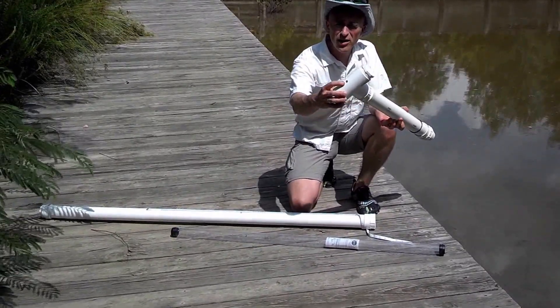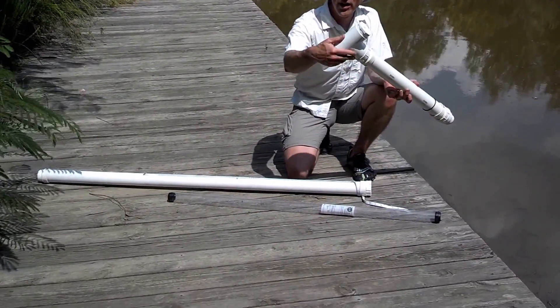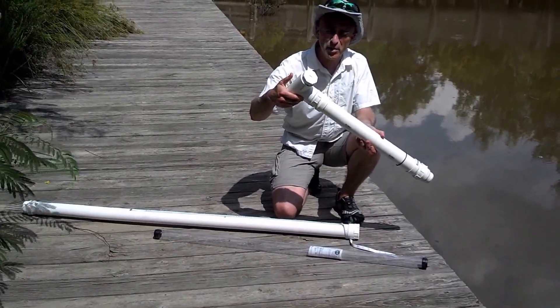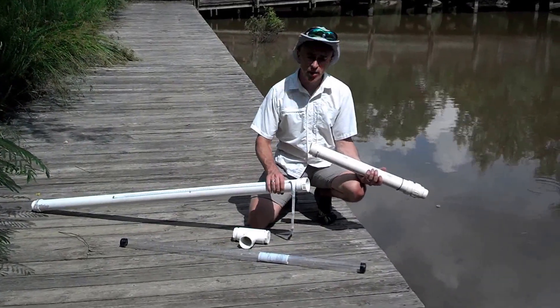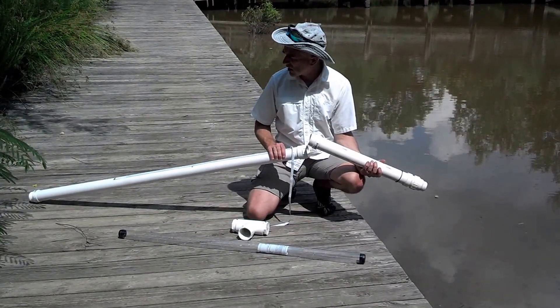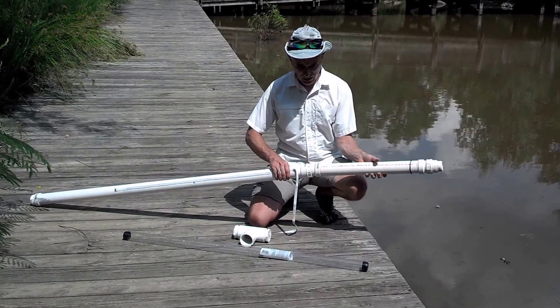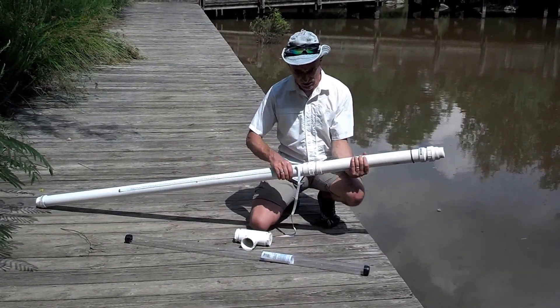Notice I have an air hole on top that will create a vacuum when I cover it with my thumb as I pull the sediment out of the mud at the bottom of the lake. If the water is a bit deeper I may use this extension handle, which I can thread directly onto the end of the core barrel like this.